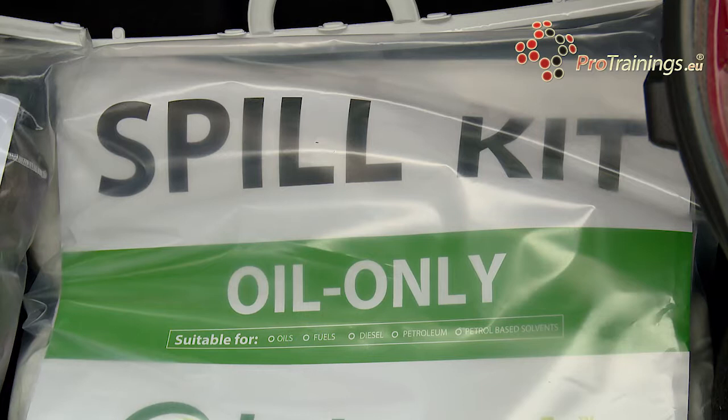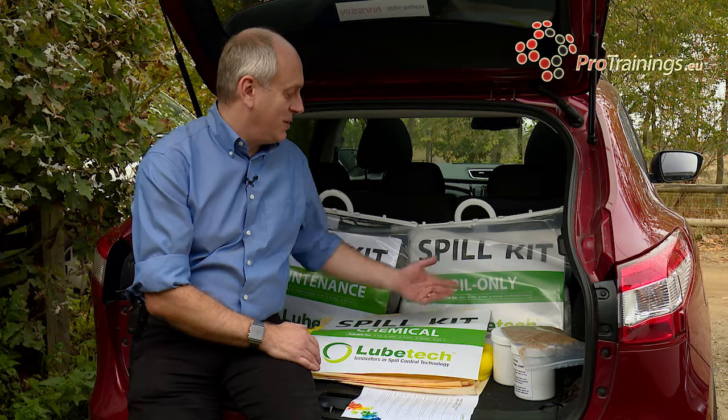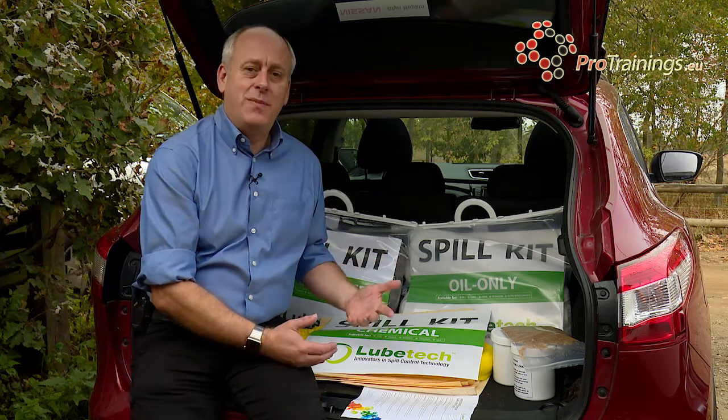The other one here is an oil kit. This is really just for oil type spills. It is suitable for oils, fuels, diesel, petroleum and any other petroleum based solvents.